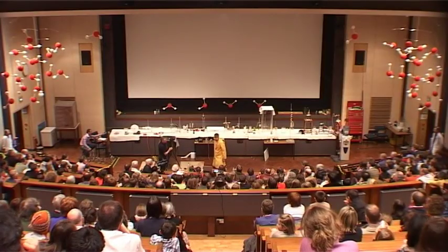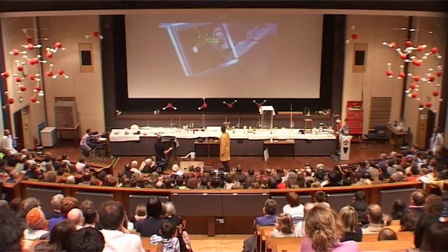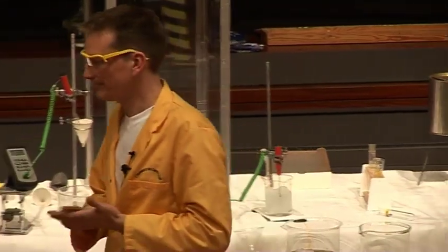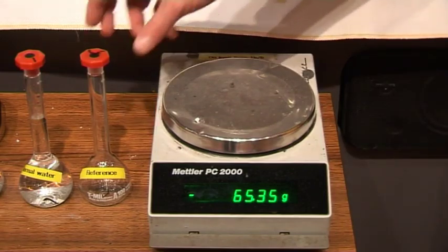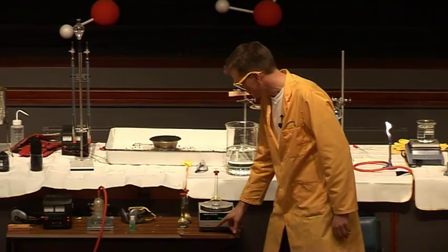Okay, right, going to heavy water. So you remember from the Batman film, this was where the Penguin accidentally knocked the switch over. So instead of having drinking water, he ended up with heavy water. Now, what on earth is heavy water? Well, I have here 3 identical flasks. One of these is just an empty flask, and I'm going to set the balance to 0 for this.